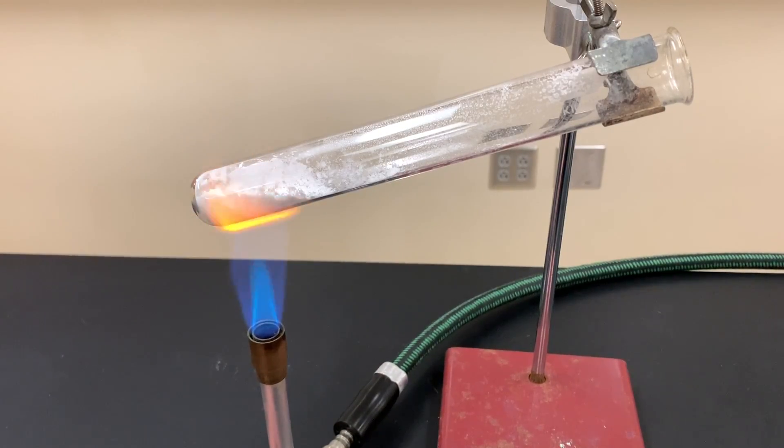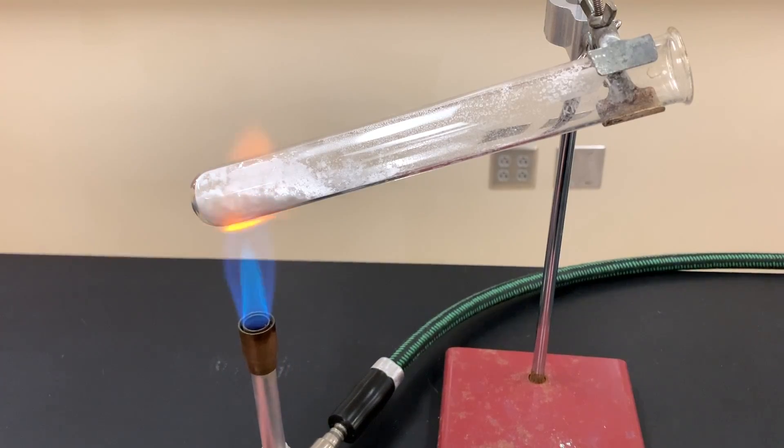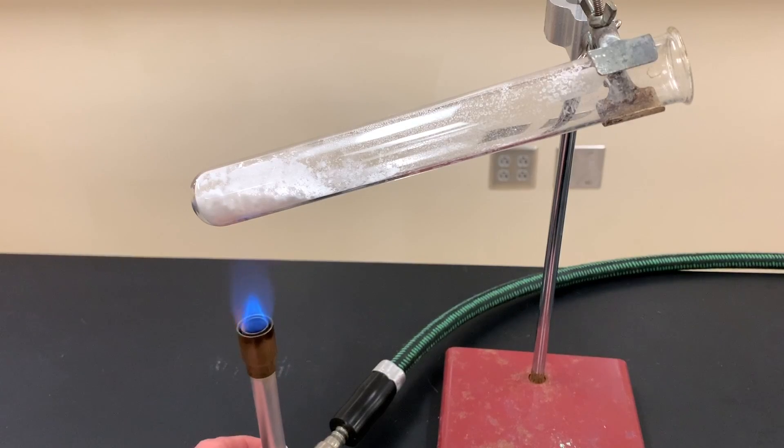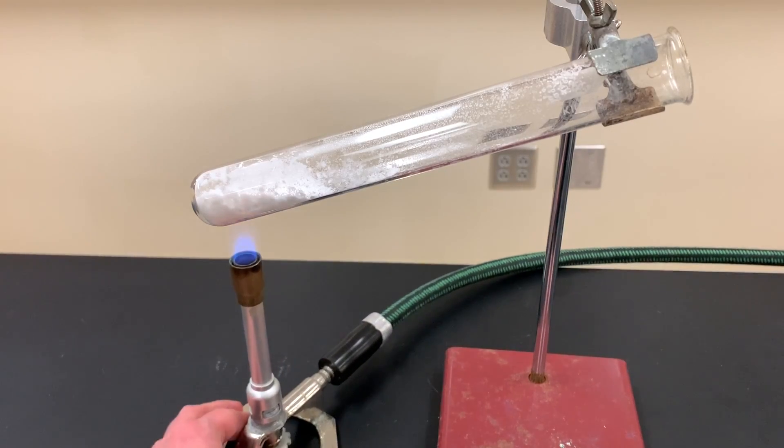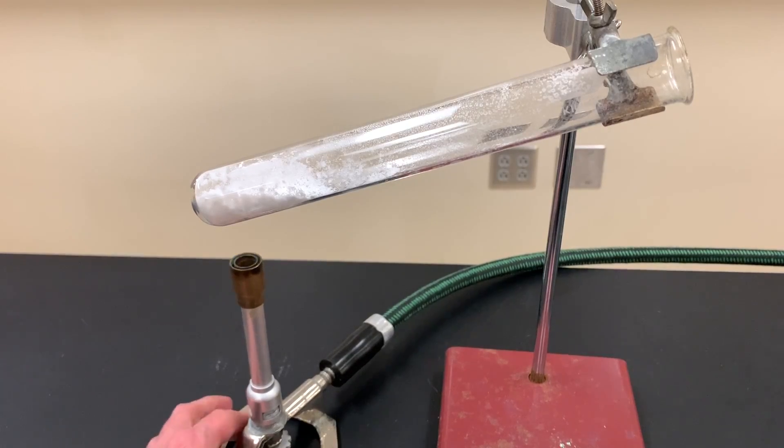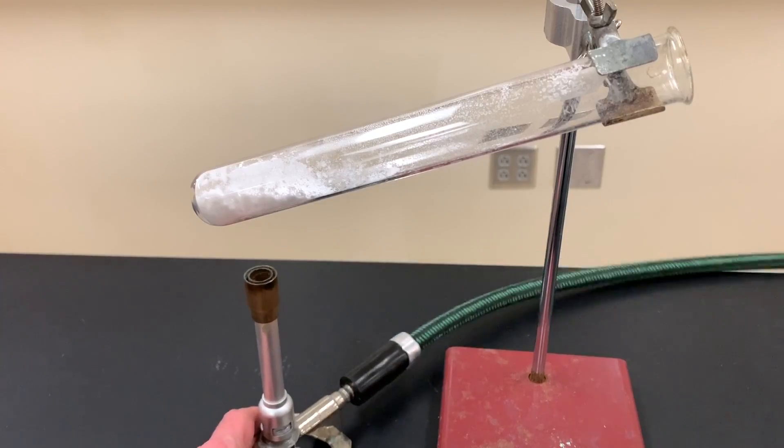It's best to turn down the Bunsen burner to a lower height. You can sometimes even turn off the Bunsen burner from the bottom. The other thing too is remember to turn off at the gas jet by turning it perpendicular.